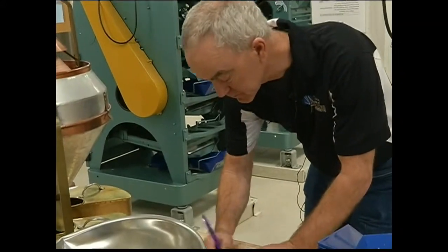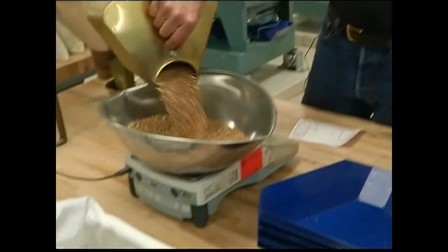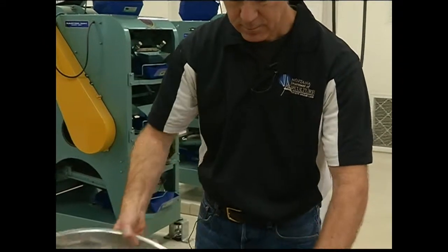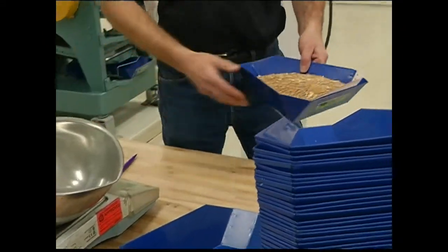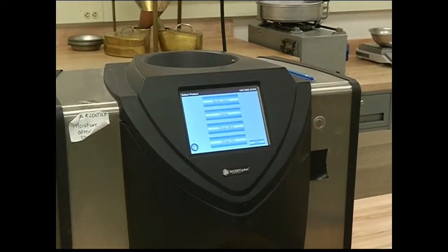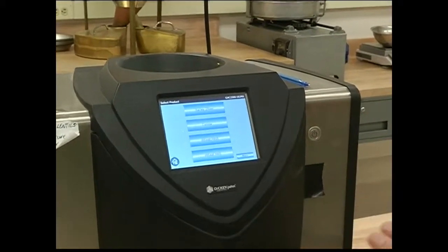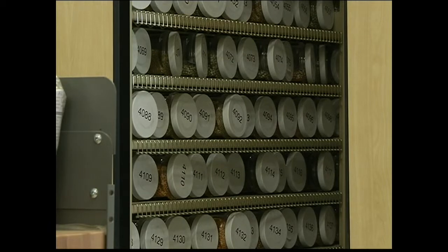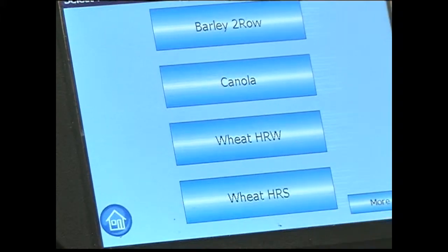One of the roles of the State Grain Lab is to protect the food supply. Rumney says most years the majority of wheat is excellent quality, but sometimes untimely rains and other factors can cause unforeseen damage. And for grain that sits in the bin, sometimes up to 10 years, the quality is always going down. The next step in the testing process is measuring moisture content. The farmer gets paid for delivering grain, not water. In the Midwest, where a lot of corn and soybeans are grown, excess moisture is one of the biggest threats to the commodity. Here in Montana, where we're high and dry, most of our samples come in at a very acceptable moisture level. So I'm going to tell the machine that we're working on spring wheat.